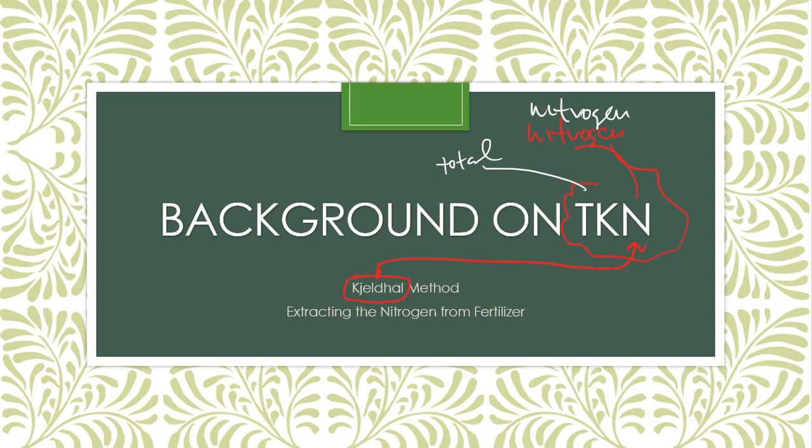It's just a fancy word or words that we use to describe a process. And this process really takes place no matter what type of sample we have. Whether we've got a food sample or an environmental sample, or in this case, a fertilizer sample, it's all pretty much bare minimum, bare bones. This is what you do, and this is the order of operations.